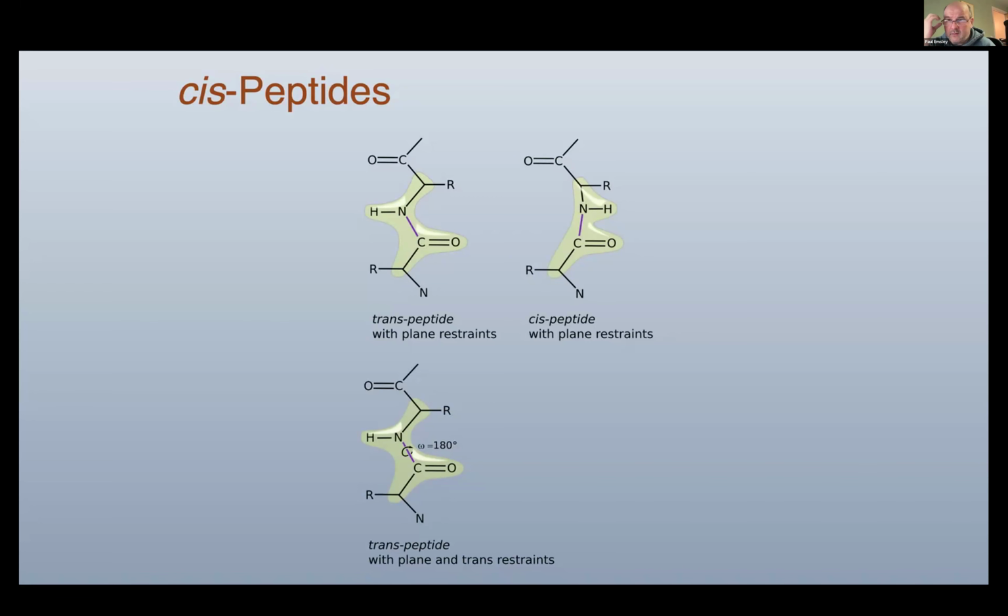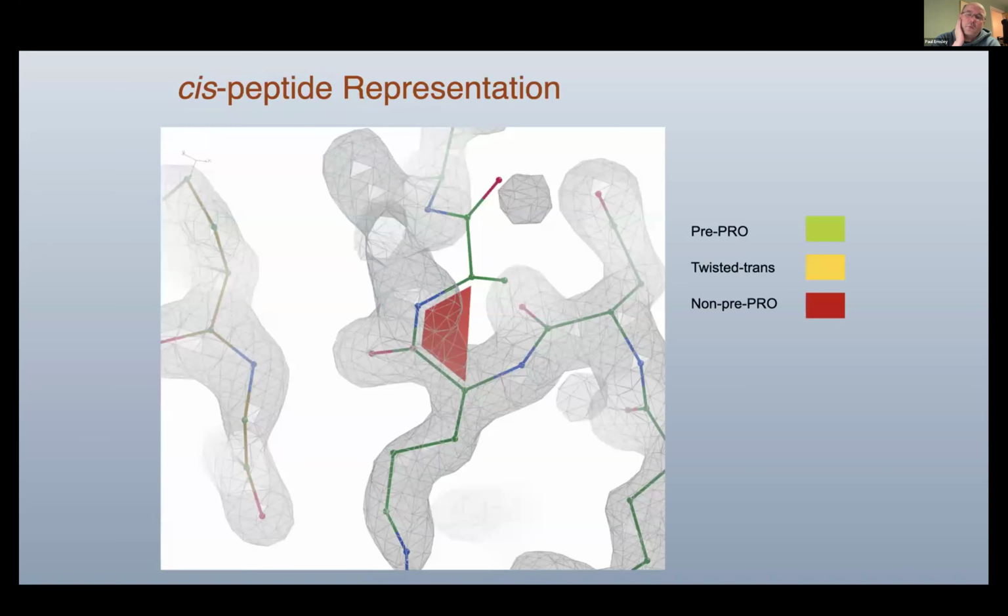Now, as Coot prepares its restraints, it analyzes the peptide bonds, and if you have a trans bond, most of them are, of course, then it will add an additional restraint on omega to keep it around 180 degrees. It very much objects to being around 0 degrees and will try to twist itself so that it's 180. This is what it looks like in Coot with the white background.